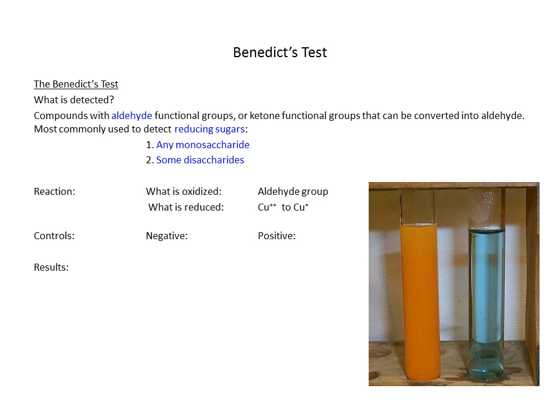So again, we start with a copper solution. Copper reacts with the aldehyde group in the simple sugar, or the exposed aldehyde group that's in a subset of disaccharides, and leads to this orange precipitate and a change from copper that results from a reduction of copper 2 to copper 1. Okay? So you may remember blue solutions being copper from chemistry class. It's still the same copper, it's still the same solution, and when you change its oxidation state, it gets different physical properties. So this is a positive result here on the left.